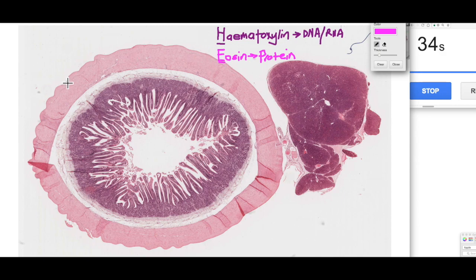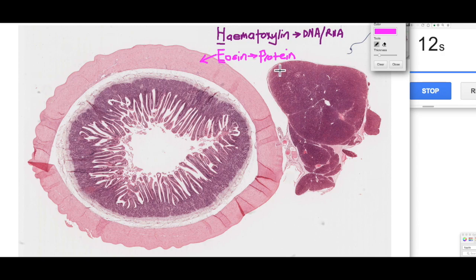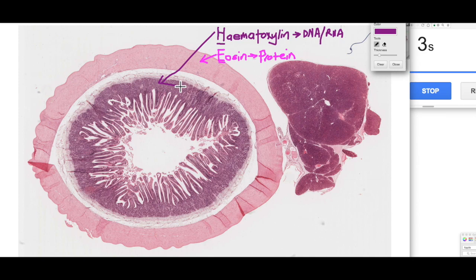For example, in this section — a section of the small intestine cut in cross section with a little of the pancreas on the right-hand side — we can see this big pink band of tissue on the outside. This is smooth muscle, and because it's pink we would say it's being stained by eosin; therefore this tissue is eosinophilic or acidophilic — it's acid-loving, attracting the acid stain. Whereas if we look at the inner part here, we can see it's quite purple, so that's actually basophilic — it's attracting the basic stain.